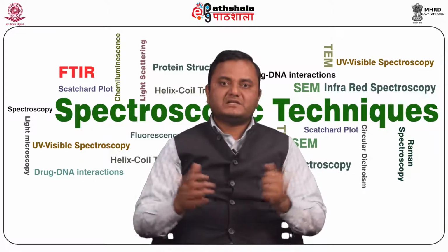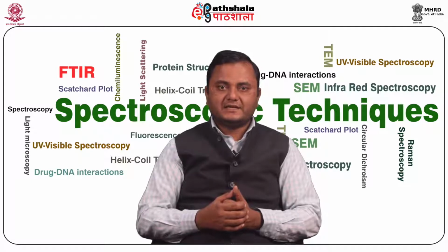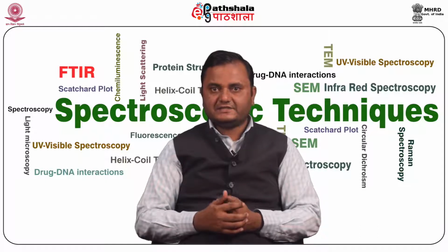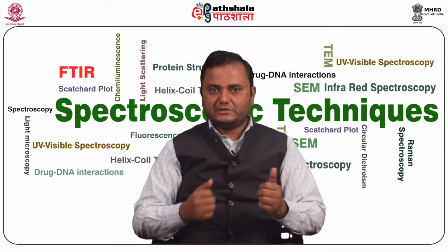The continuous Fourier transform, used on continuous signals, is defined in this relation as a function of x, with e to the power of minus 2 pi i wx.